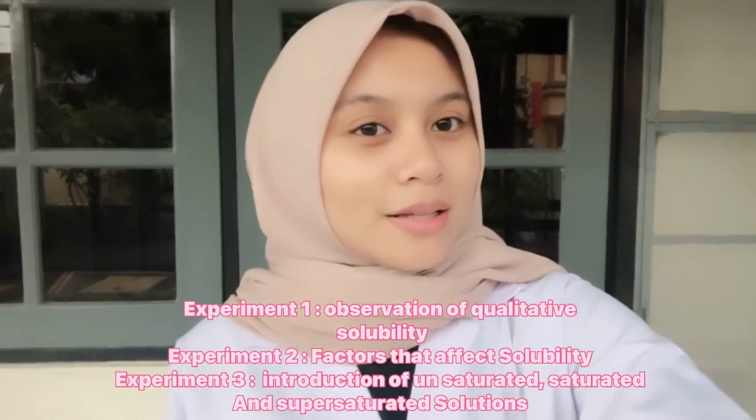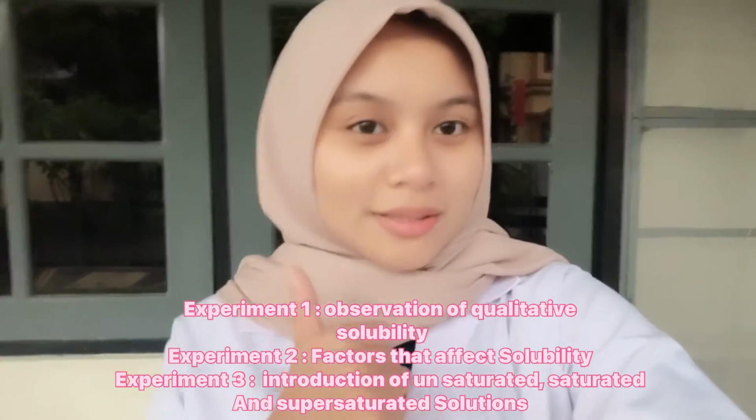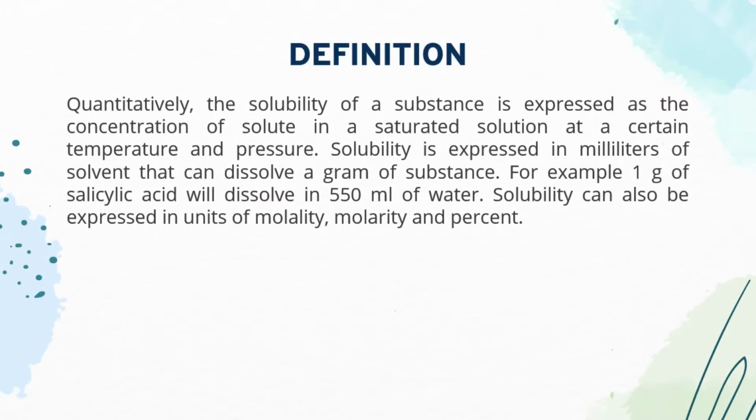I'm from class D and I'm going to do a practicum whose title is Qualitative Solubility. In this practicum, I'm going to do 3 experiments. The first is observing qualitative solubility, the second is factors that affect solubility, and the third is saturated, unsaturated, and supersaturated solutions. Before we go to the practicum, I'm going to explain what qualitative solubility is.